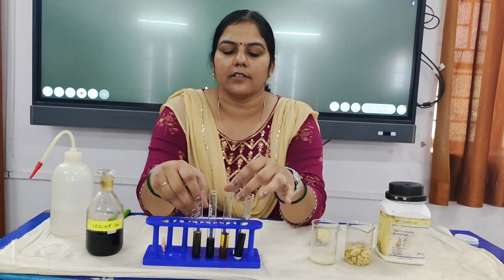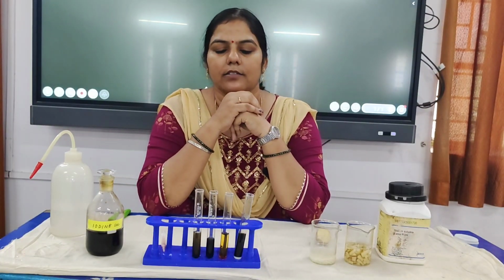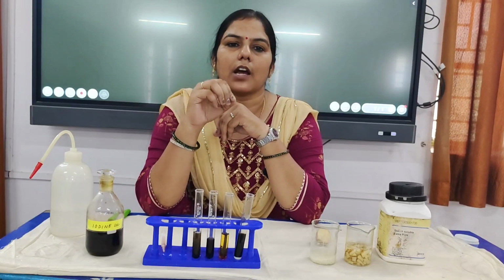So with this test, we can clearly test whether a substance contains starch or not.